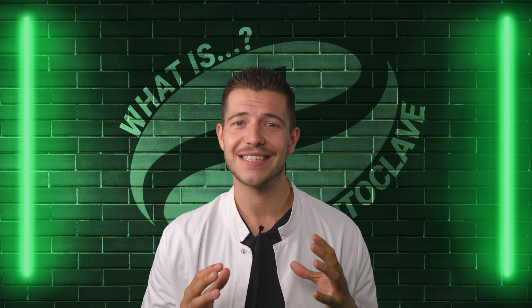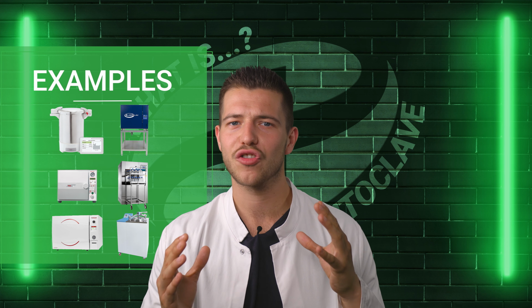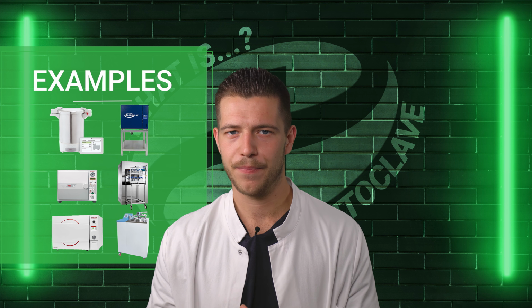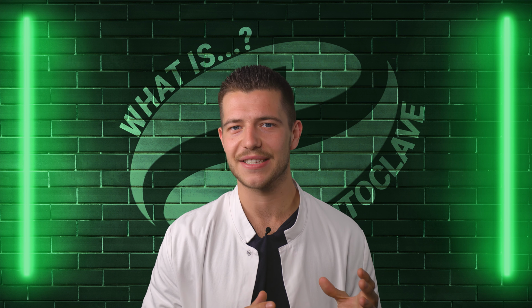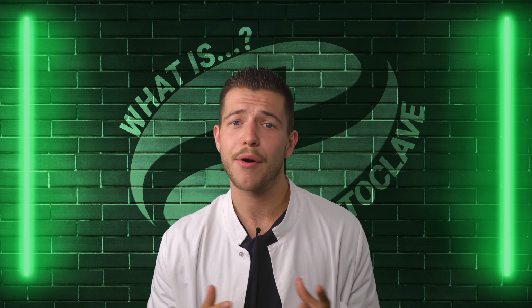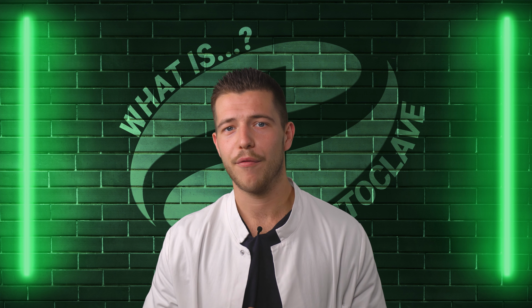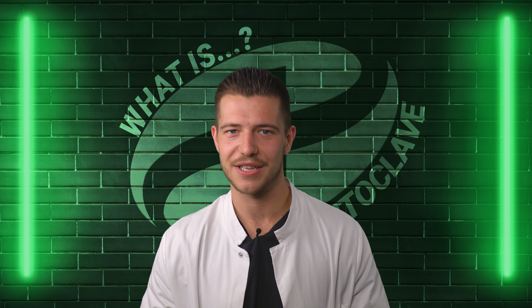An autoclave is a sealable vessel in which materials or instruments can be treated thermally under high pressure. In general, they are used in every laboratory, for example, for the sterilization of instruments and materials. But as well, they can be used for carrying out chemical reactions or for material testings under high temperature and pressure. They should just be used by trained personnel, and this is why most of the manufacturers we've got in our portfolio offer such trainings for your personnel.